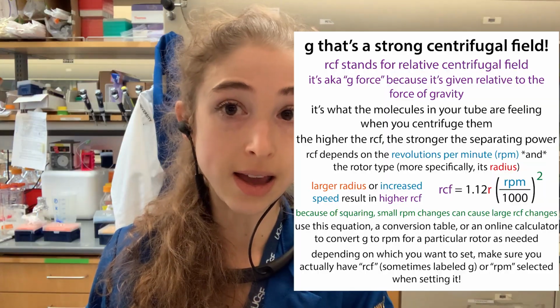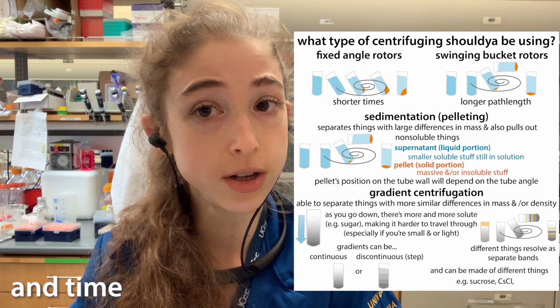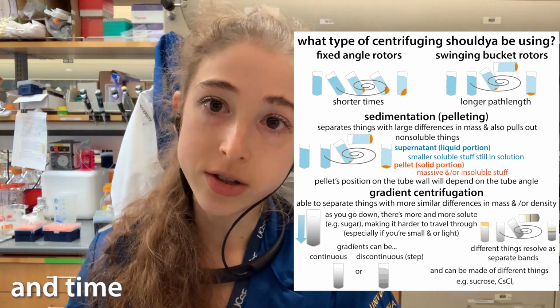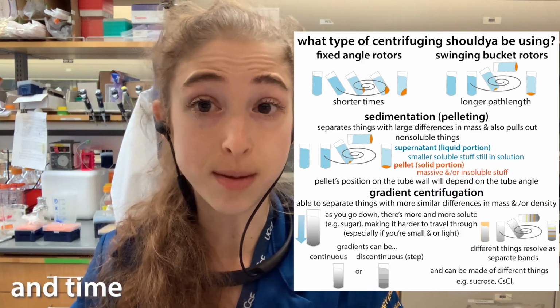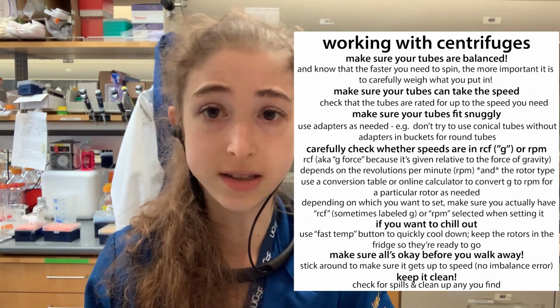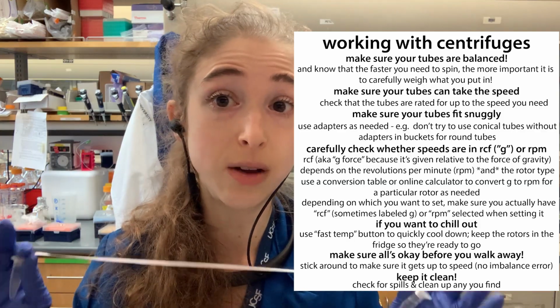So the main things that you have to choose are going to be what centrifuge you're using, what rotor you're using, what speed you're using, what temperature you're using. For the speed and the temperature, you can get those based off of protocols, and then really the size depends on the size of your sample. But those are just the basics of these lab centrifuges, and I hope that was helpful.